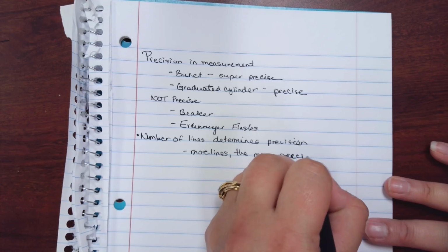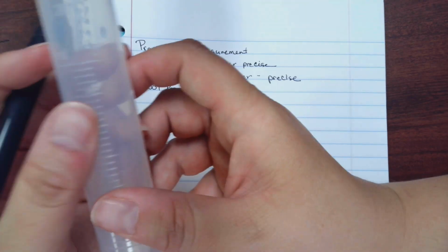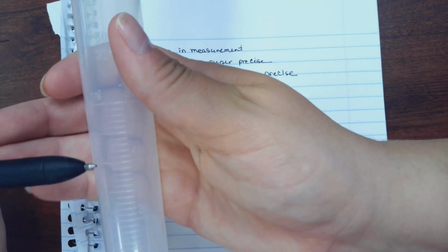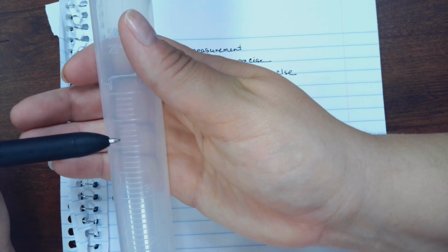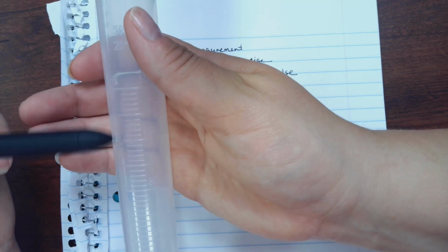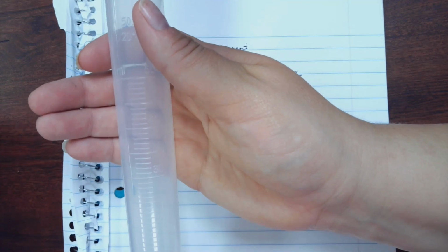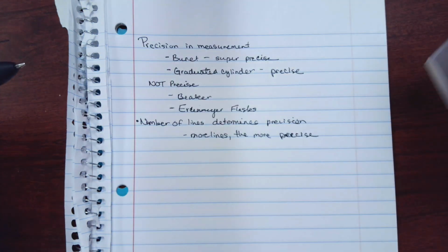So that's why a graduated cylinder, if you look at my graduated cylinder, I know it's kind of hard to see because it's clear, but here, let me put my hand behind it. There we go. So we've got a line at the 40, we've got a line at the 50, but then we've got little tick marks between 40 and 50. So this would be 41, 42, 43, 44, 45, 46, 47, 48, 49. So we actually have lines to the ones place on a graduated cylinder, whereas on a beaker, we only have lines to the tens or sometimes even the hundreds place. So there are much fewer lines on a beaker than there is on a graduated cylinder. So a graduated cylinder has more lines. It's definitely going to be more precise.